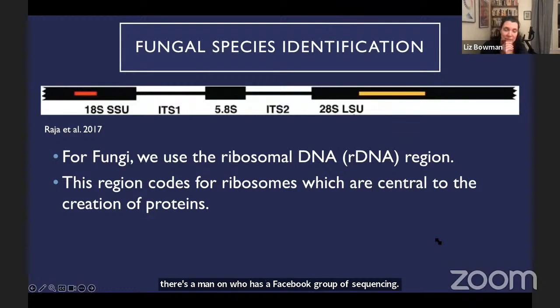I'm sorry, I can't remember his name right now; I'll try to remember it and send it out. He's teaching a class on MinION in March that I signed up for, on doing ITS barcoding, so species identification, and I'll be asking about that. But I don't see any reason why not.